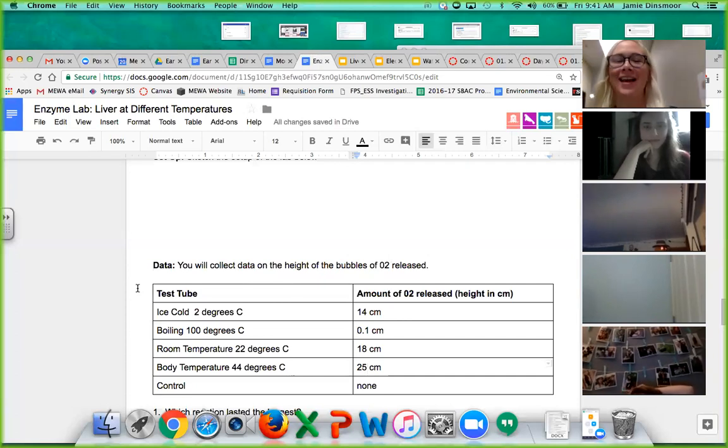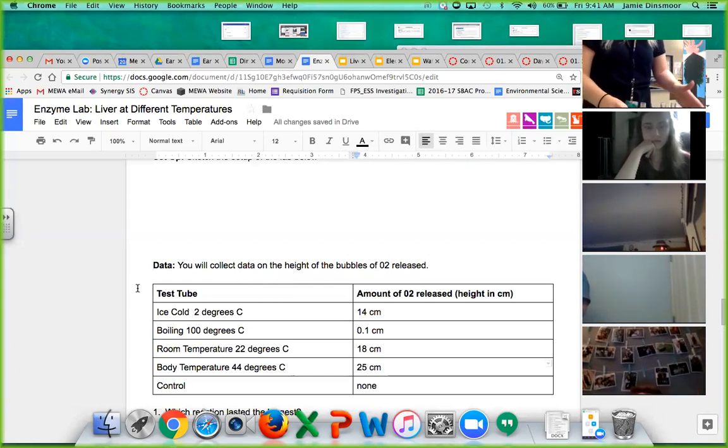Yeah, exactly. All right, guys. So we got the lighter. That means we're going to be able to prove this right now. We're going to use some room temperature liver because we can tell from our data that that's going to produce some oxygen, right? And we're going to try to get this ember. It's pretty hard, so I'm probably going to have to do it a few times, because as you can imagine, you got to get it timed completely right when the oxygen's coming up.